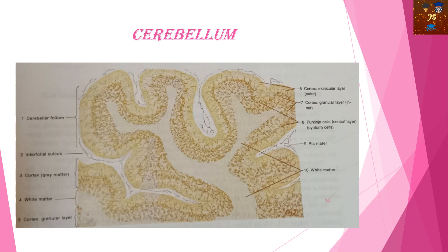Next I am going to discuss the cerebellum. The cerebellum is very important physiologically because it keeps the body balance. You can see that it differs from the spinal cord with its folds — there are different types of folds, which differ from part to part. This folded part is called the cerebellar folium. These folds contain the gray matter.